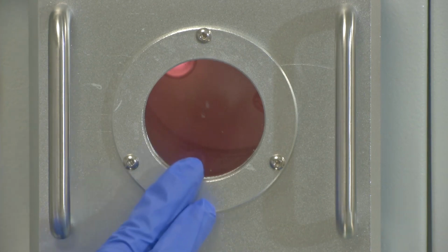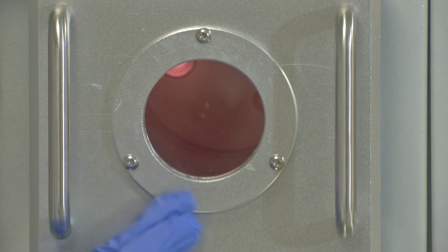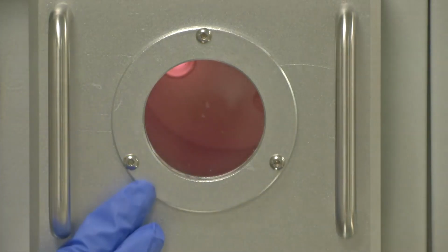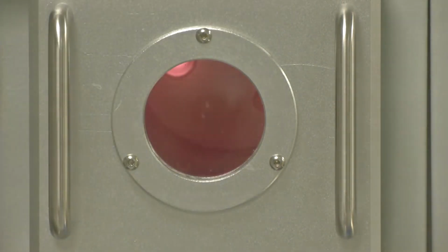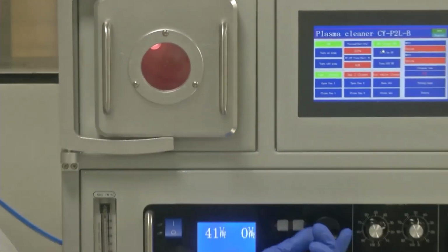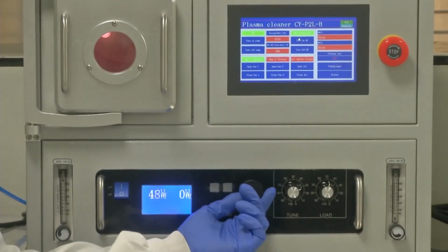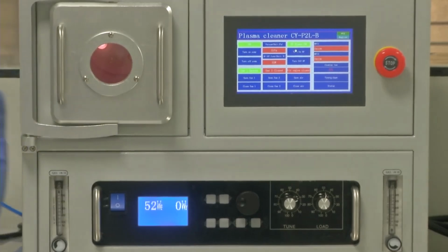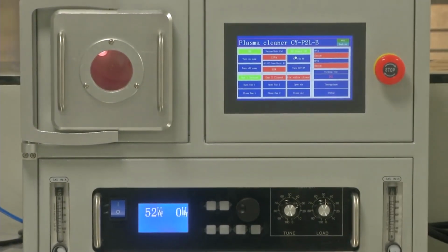You can clearly see the plasma inside now. It is pink in color. This is the oxygen plasma that has been created. Pink color plasma inside at 36 watt RF power. I am tuning it. Whenever return power comes, I will tune the RF control. So this is at 50 watt RF power and plasma is ready for you to work on the substrate.